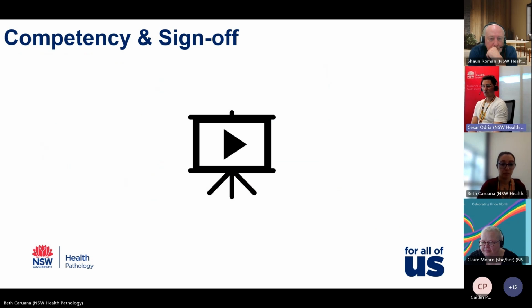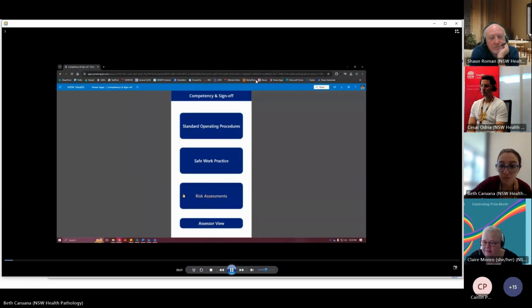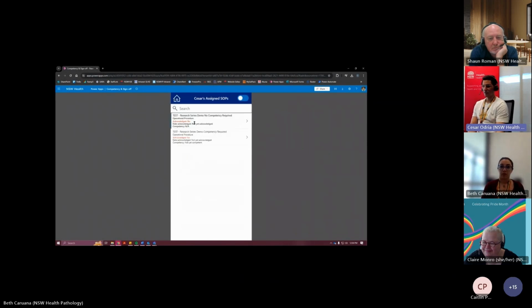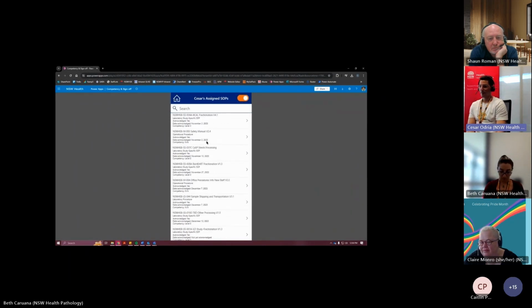Just go into a little demo video. So standard operating procedures, safe work practice, and risk assessments. So going into standard operating procedures, we can see these are my items that are unacknowledged, and toggling this button here, we can see everything that is acknowledged and unacknowledged. We have a search function as well, so anything that contains the word bioheart will populate there.